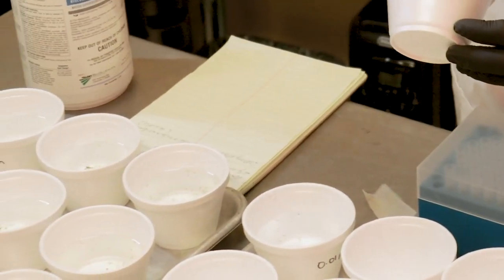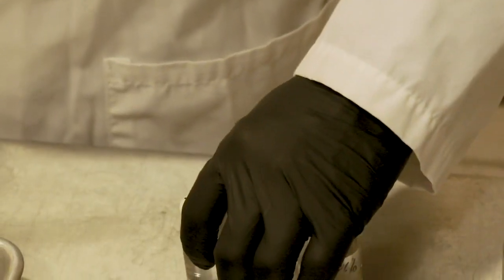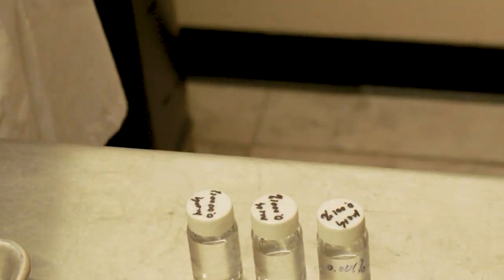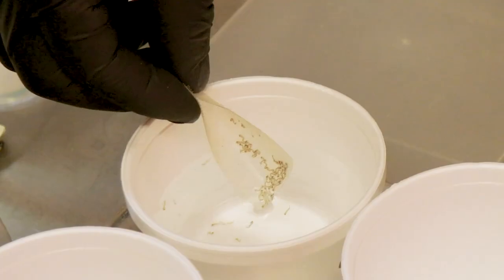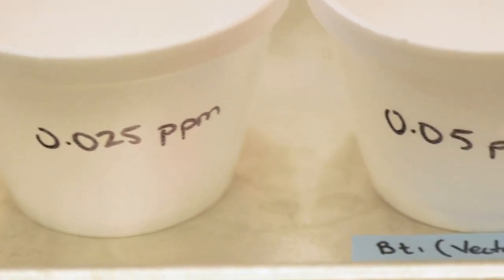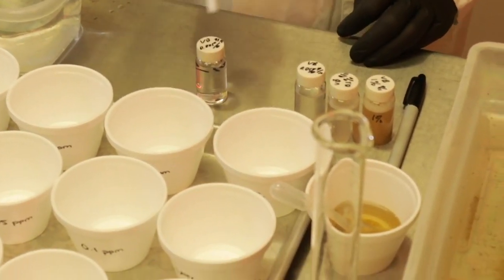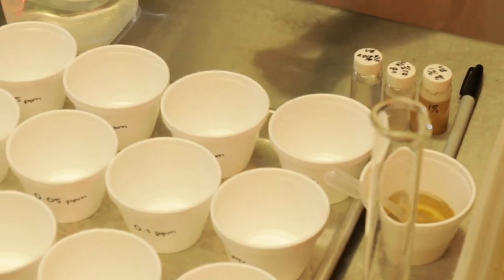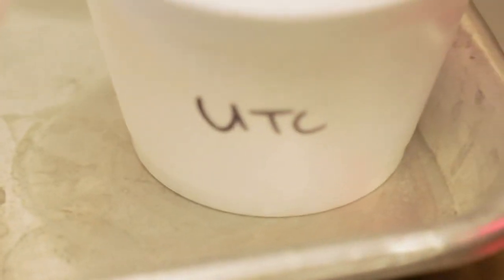You will need either formulated or technical grade forms of the control agent, 20 milliliter glass vials to mix different concentrations of the active ingredient being tested, pipettes, and screens for transferring the larvae. You want to create a range of concentrations of the active ingredient to test against the mosquito larvae, resulting in 5 to 95% mortality within the exposure period. Remember that you also want to include an untreated control in each bioassay.